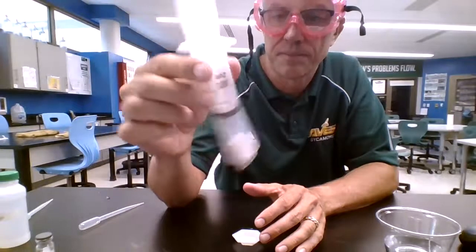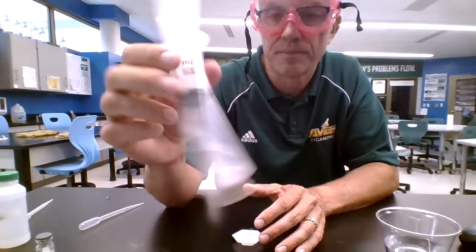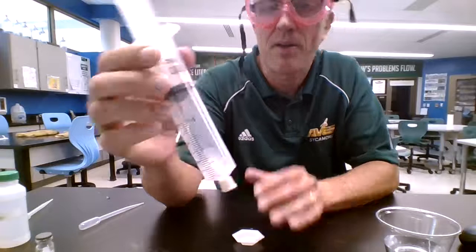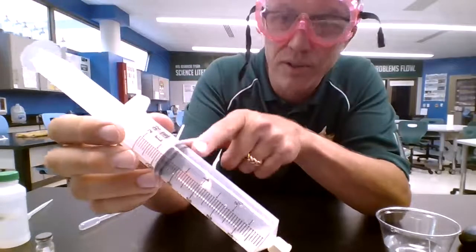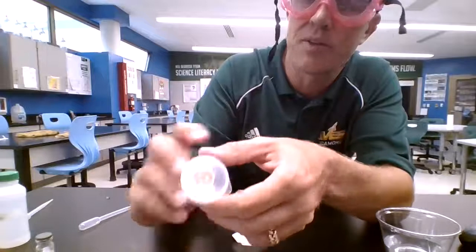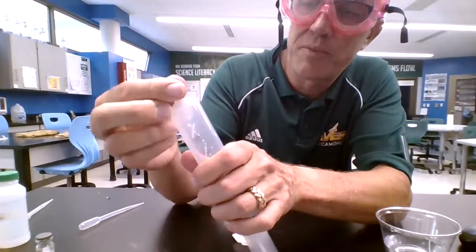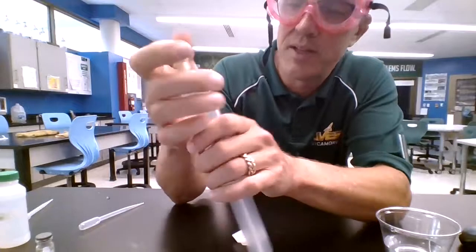Shake it up. And lo and behold, stuff starts happening. There you go. And now, if this goes too far, watch it. It's getting past 50, so I'm going to say it's going too far. I'm going to go like this, and I'm just going to release a little bit. And that kind of stops it from expanding. Put the cap back on, and that's it.